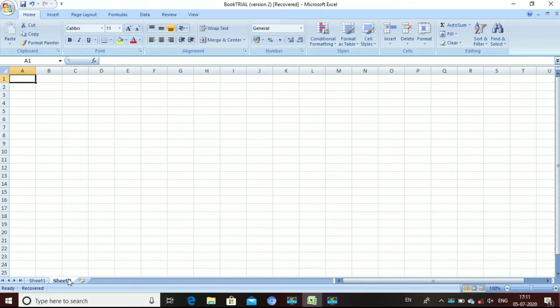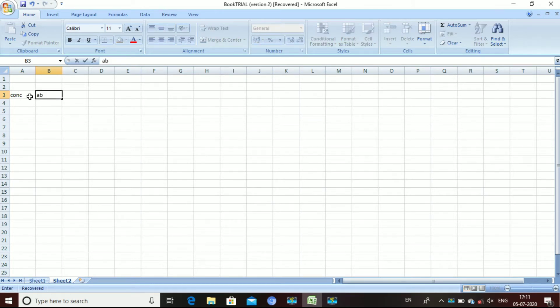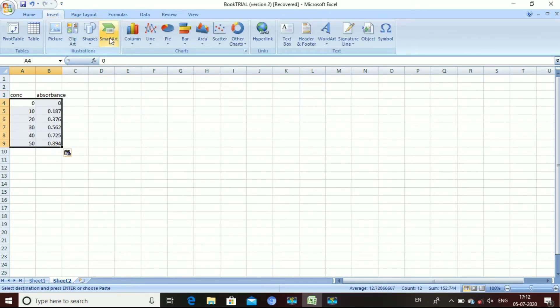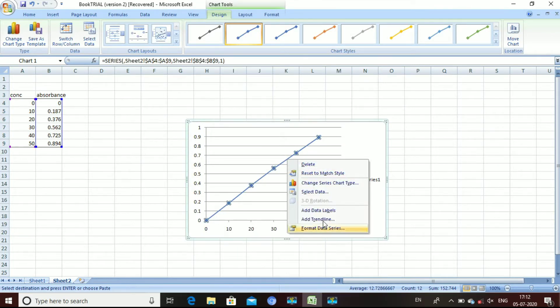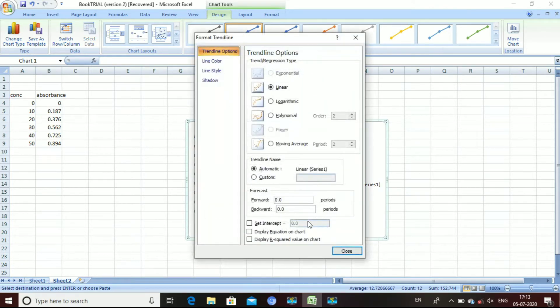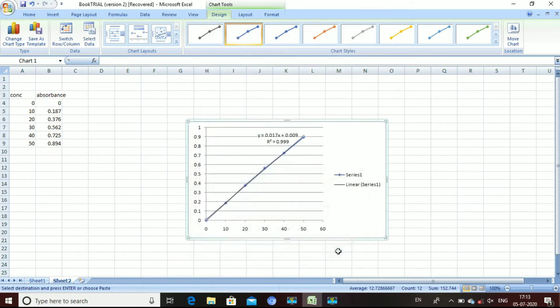For the dissolution study, first we have to make a standard curve using the concentration and absorbance values we obtained. I'm adding some reference values to draw the standard curve. Select these two values and go to Insert and select Scatter. You will get the standard curve. Place the cursor on the straight line, right-click, and select Add Trendline. In the options, select 'Display R-squared value on chart' and 'Display equation on chart', then close it.